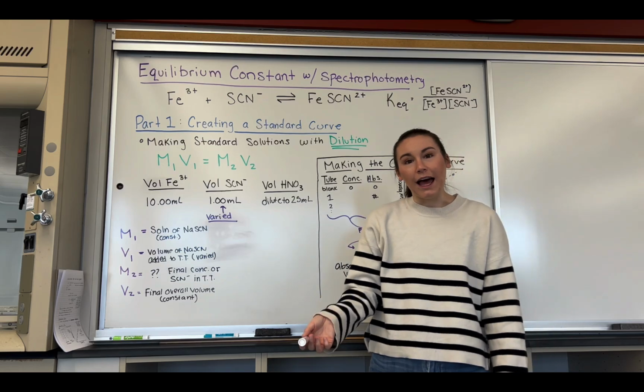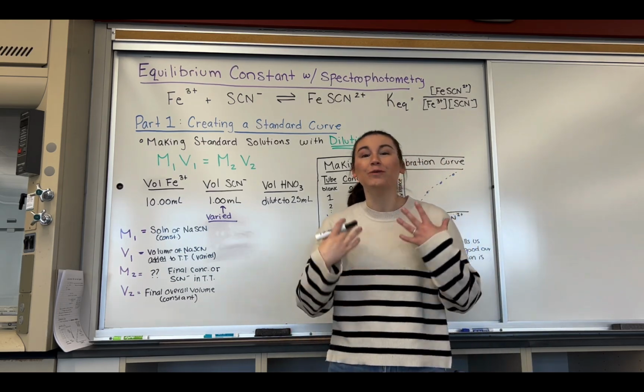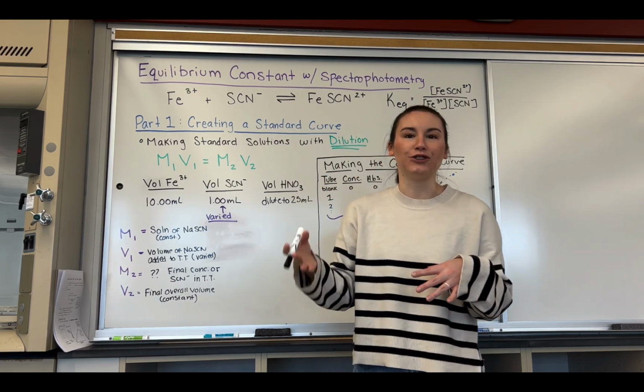And we're looking at how the molarity changes depending on the volume change. So in our lab, the first thing that we did, which you are unfortunately not going to be able to do, but you're going to see me do, is we're going to make 5 standard solutions.